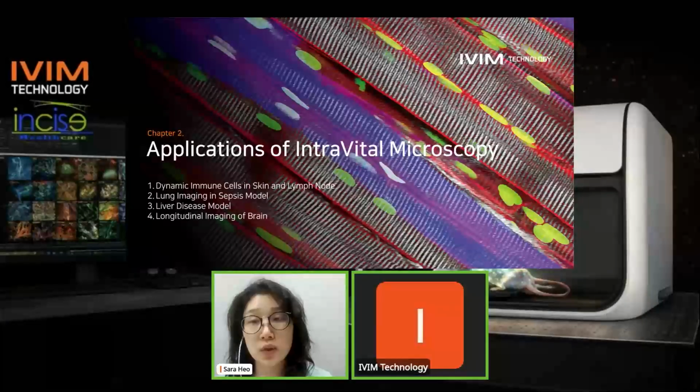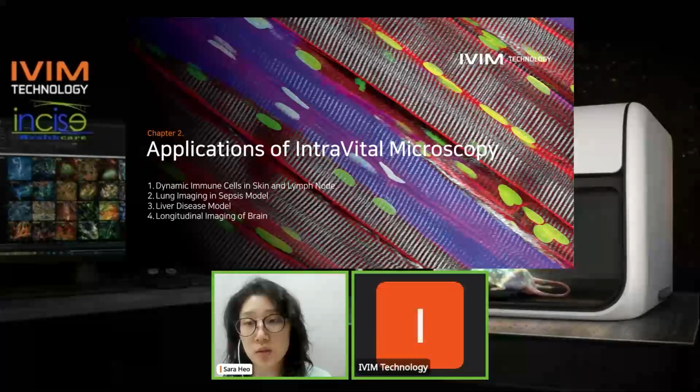Now I'm going to move on to the applications of intravital microscopy. I'm going to show you some of the studies that used intravital microscopy with the chambers and windows that I have just introduced.